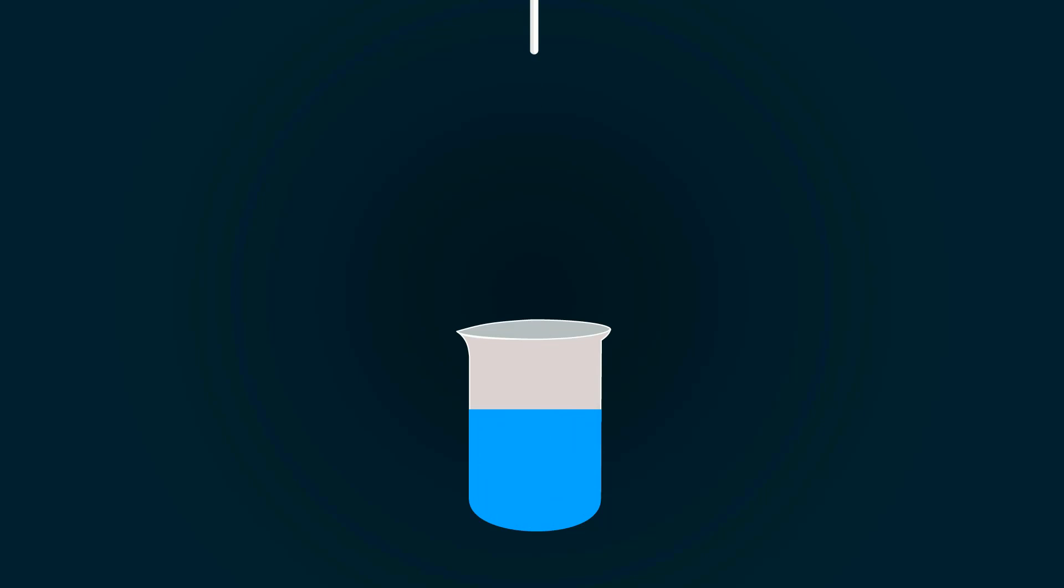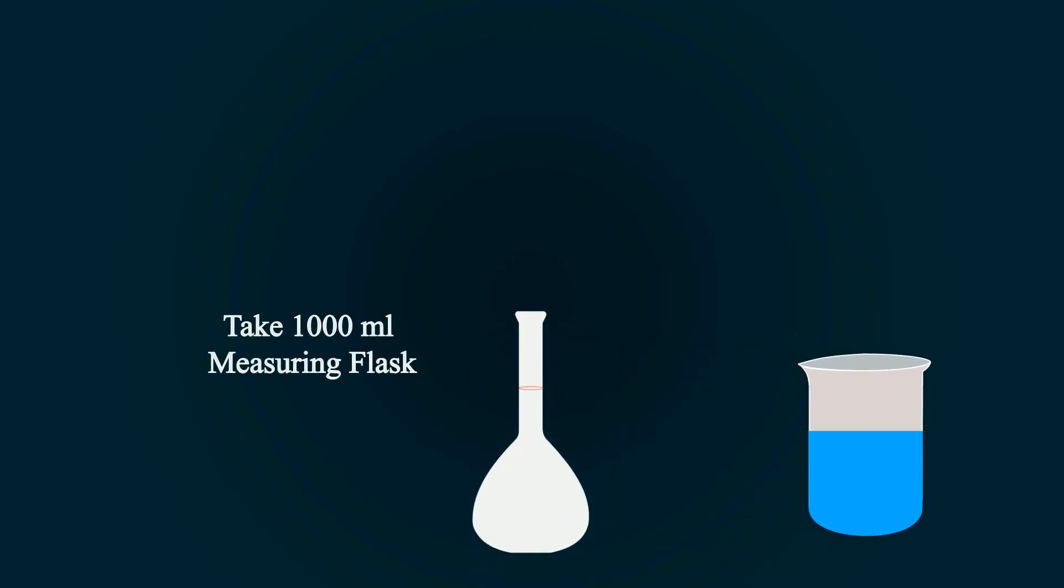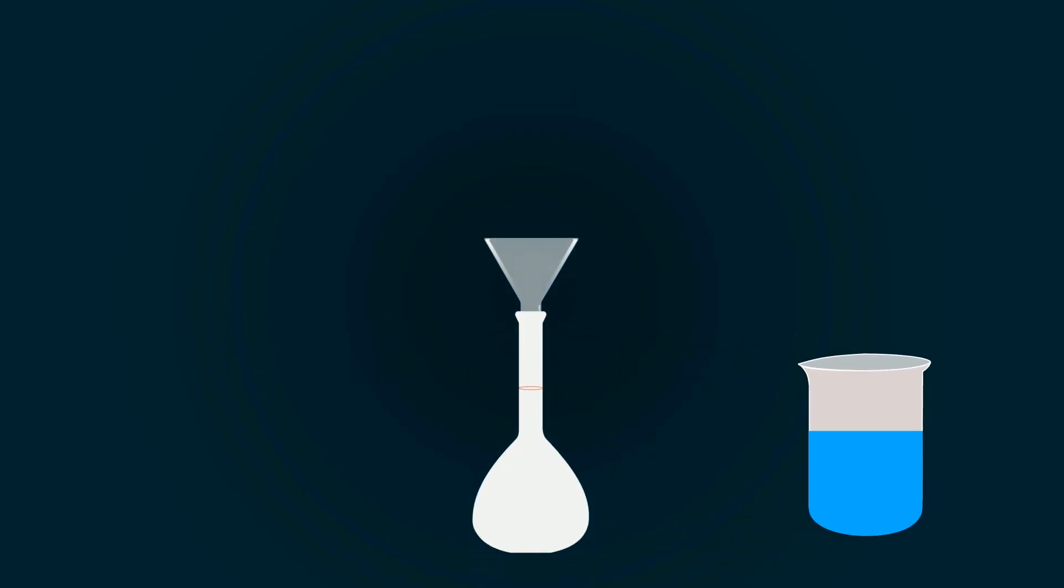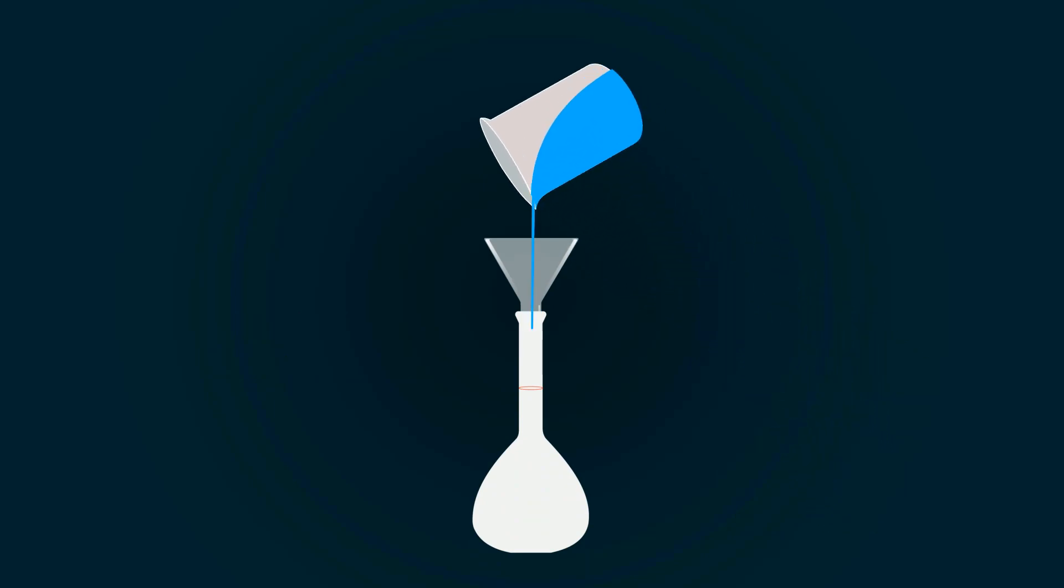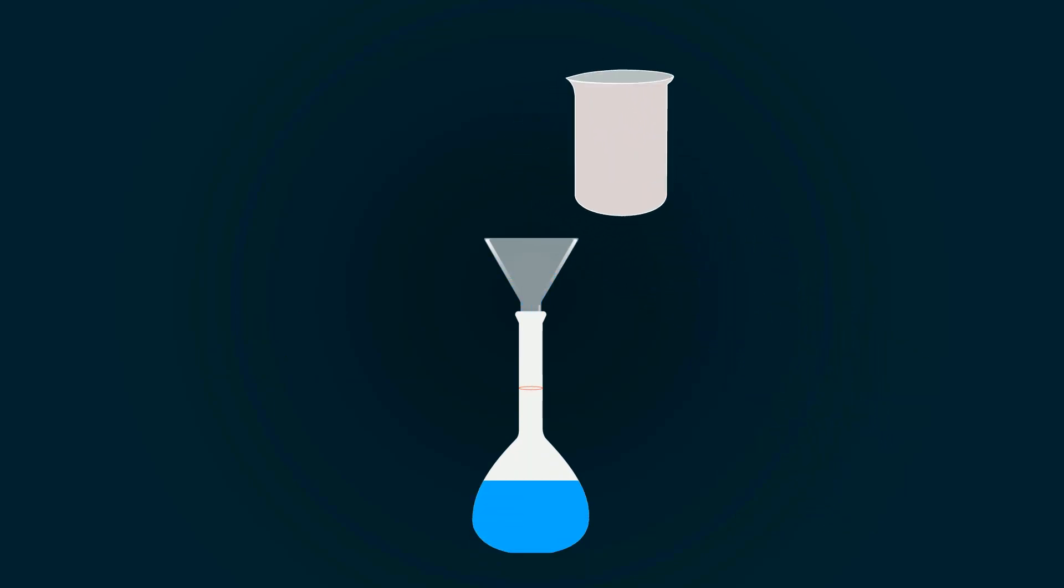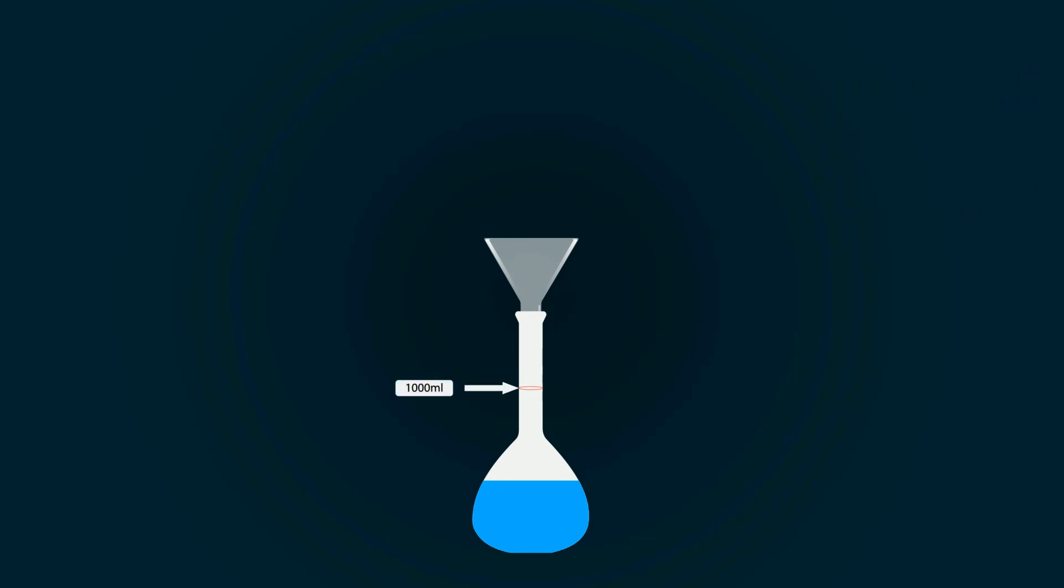Now take a measuring flask of 1000 ml and put a funnel on the top of the flask. Put all the solution into the volumetric flask. You have to fill it up to the 1000 ml point. For that, you have to add more distilled water in it.